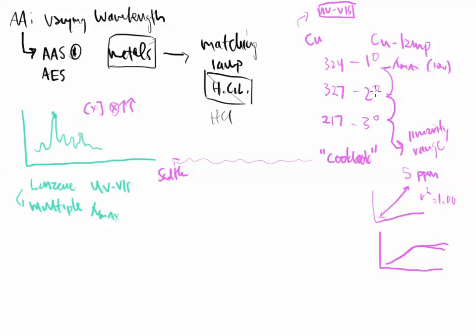So what happens is that the secondary wavelength just brings everything back on scale, and it straightens the line back up because its linearity might be a little higher. Or the tertiary wavelength. The tertiary wavelength, well, that one's probably a little bit higher. The linear range maybe goes higher than 20, maybe 30, who knows, depending on the instrument, depending on the settings. And this will tell me the cutoff value for the tertiary setting. So that's how I determine which wavelength will be the best for my analysis.